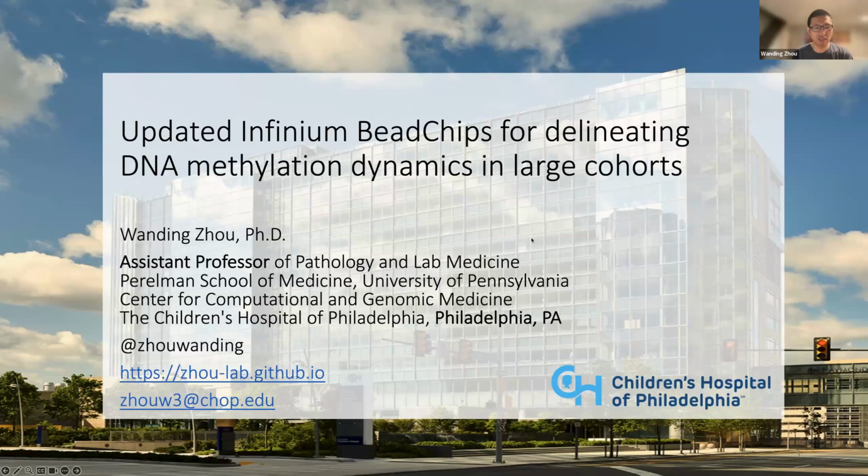As many of you probably know, I'm a computational epigeneticist. I've been working with Illumina, collaborating with them to develop both content and technologies for the Infinium bead arrays for several years. I'm not the original developer of this technology, but I participated in the design of several arrays starting 2015. I'm just going to take this opportunity to give everyone, potentially the users of this technology, some updated knowledge of the Infinium bead arrays, particularly the mouse arrays and the EPICV2 arrays, which we recently characterized.